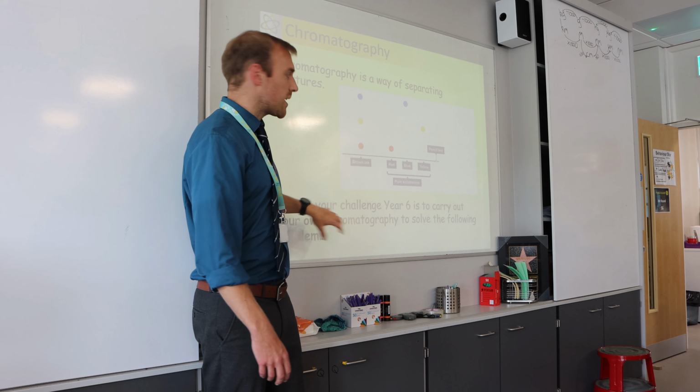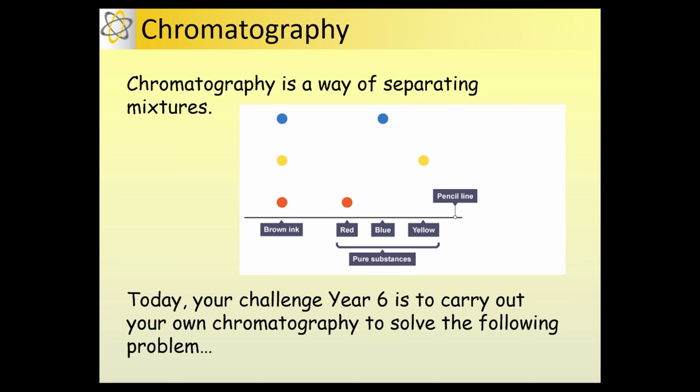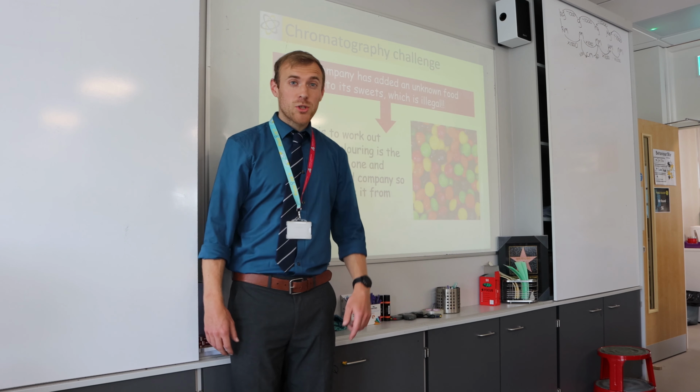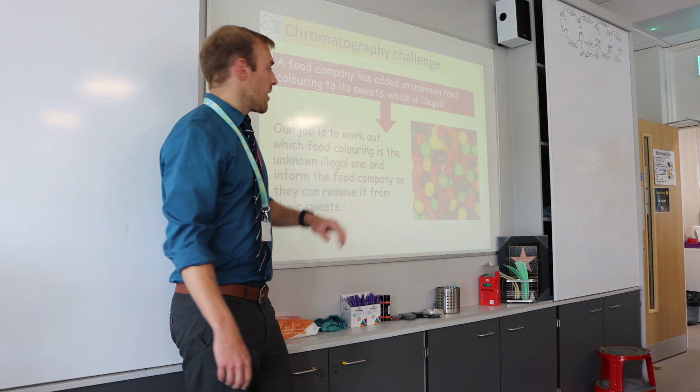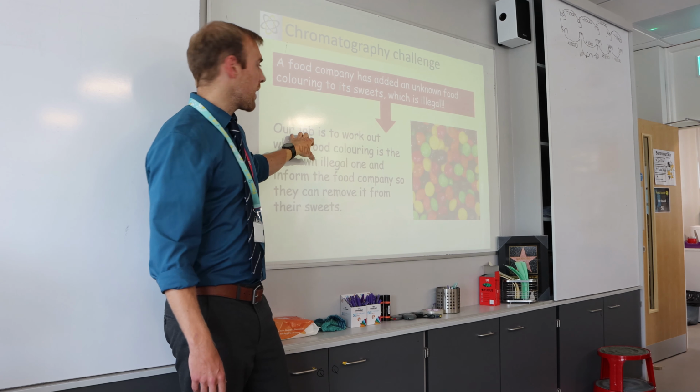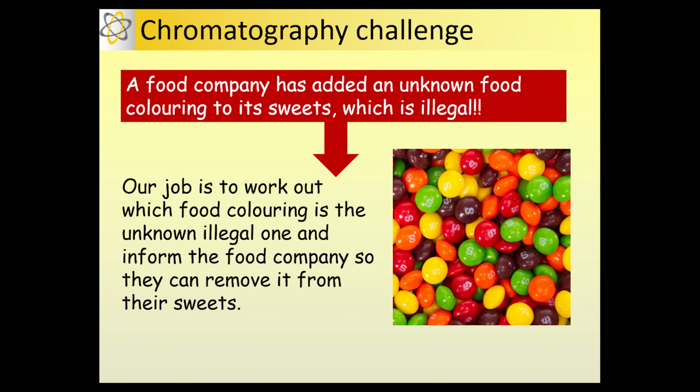So your challenge today, Year 6, is to carry out some chromatography, and you're going to try and solve the following problem. So your chromatography challenge today is: a food company has added an unknown food colouring to its sweets, which is illegal. Dun dun dun! So our job is to try and work out through chromatography and through the practical you're going to do which of the food colourings is the banned, unknown, illegal one, and which ones are safe to eat.